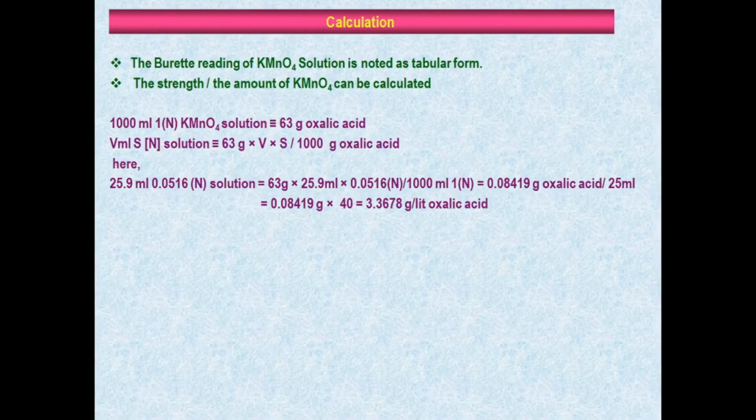Now the burette reading of the KMnO4 solution is noted in tabular form, and the strength or the amount of KMnO4 can be calculated using the following equation.